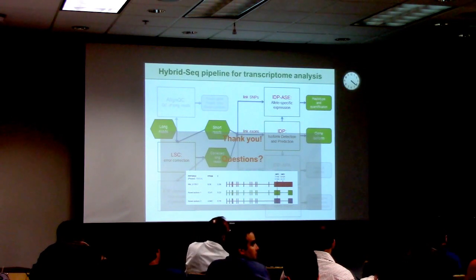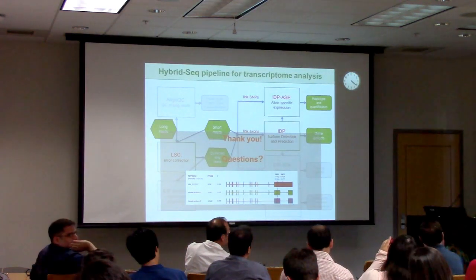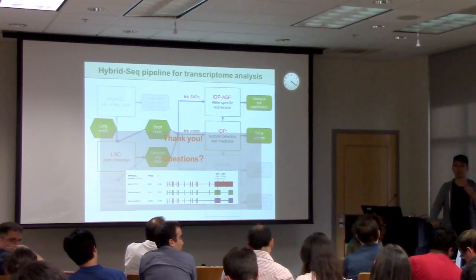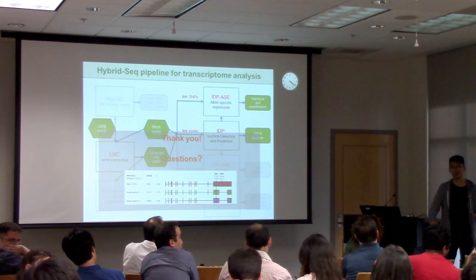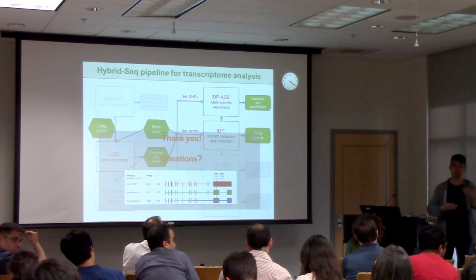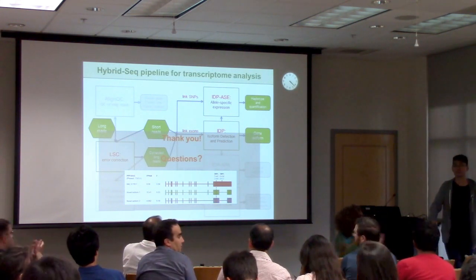I see, okay. But you only compress strings of the same letter, right? You don't compress other types of repetition. No. Yeah, because actually this is just a trick, a transformation of the sequence, to help improve the alignment step. So actually it does nothing in the error correction. Once you find this short read aligned to this long read, we decompress it and then generate the consensus. That's the thing. Thank you.